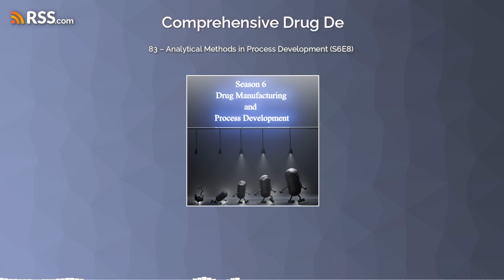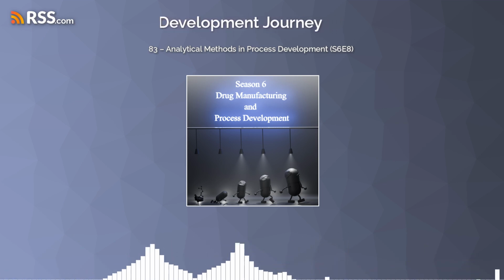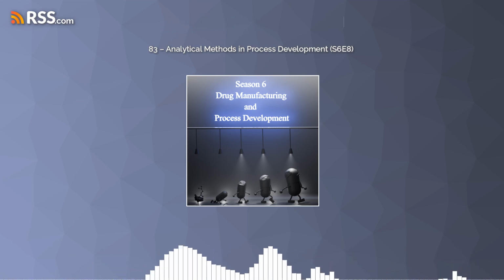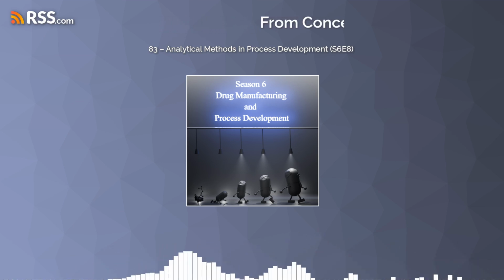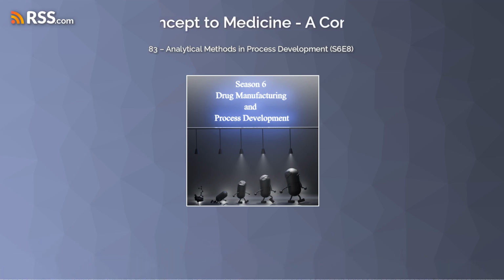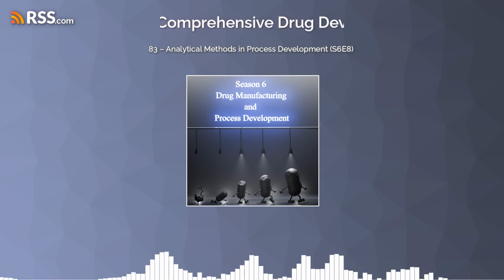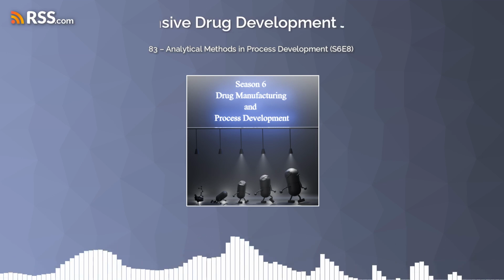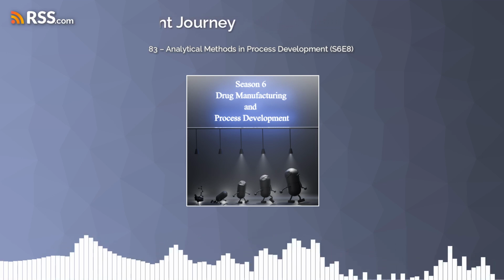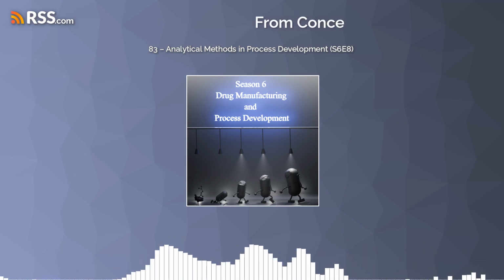Exactly. For each piece. And as one of our sources on ADME, or absorption, distribution, metabolism, and excretion technologies, points out, LCMS is incredibly versatile. So while it's really crucial for understanding how drugs are broken down in the body, it's equally important in process development for pinpointing and quantifying all sorts of components, including those impurities that might be forming. It's like that really sensitive detector for anything you don't want in there. Yeah, for those unwanted guests at your molecular party.